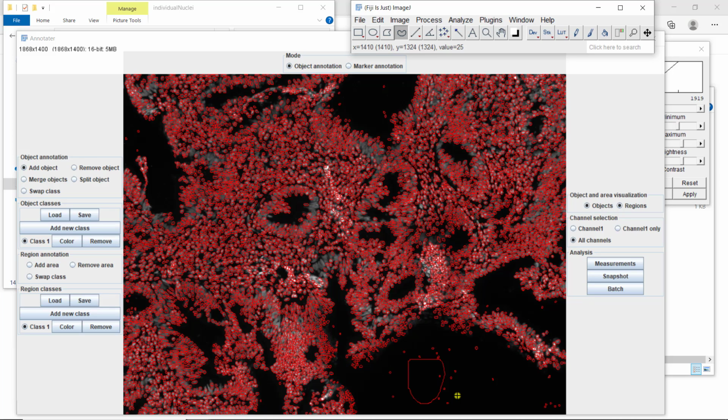We are very confident in the areas detected as part of nuclei with UNet. So everything that is detected as nuclei with Mask R-CNN that is not part of nuclei with UNet is going to be removed. Everything else, when you look at the morphology with Mask R-CNN, looks much more realistic. So we're going to take the results from Mask R-CNN everywhere else. But when we are missing, like this region where we are clearly missing quite a lot, we're going to take the results from UNet. So basically, we're going to start with Mask R-CNN. We're going to use UNet first to get rid of the nuclei that don't make any sense. And then we're going to use UNet to add nuclei where we missed areas with Mask R-CNN.